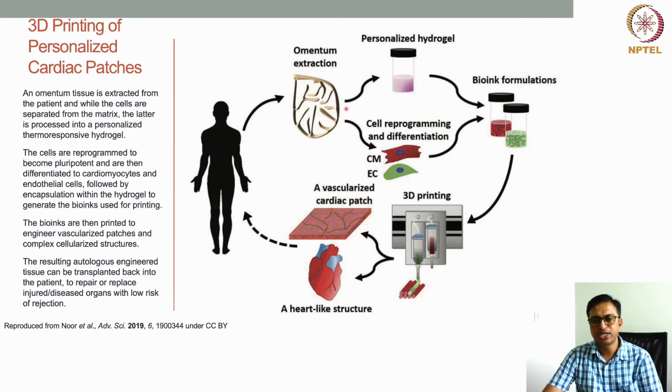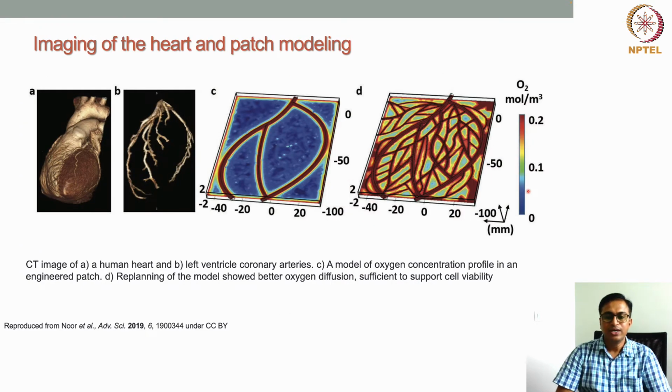So this is the schematic for generation of personalized thick and vascularized cardiac patches using the patient's own tissue using a 3D bioprinting approach.